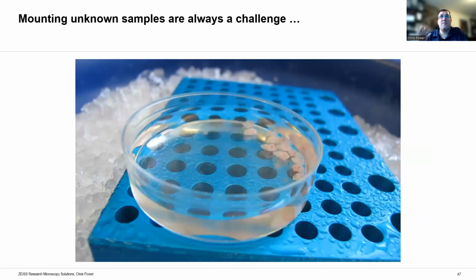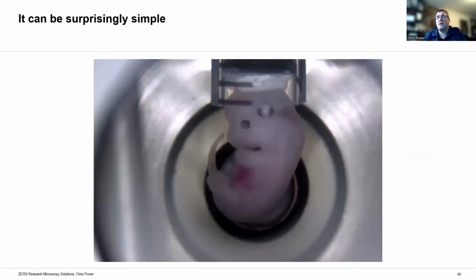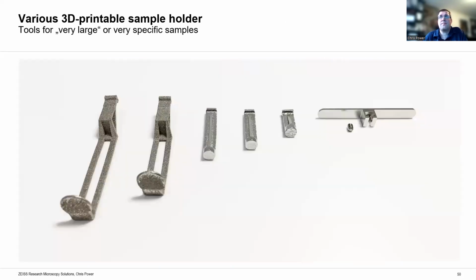To give you an example of where we sometimes think a little bit different, this was a neuronal sample. Hang on a minute, I think we come back to that one, but yeah, this was an example with, I forget the model embryo here, but this was looking at cancer cells, I believe. So again, on an uncleared sample, you won't get all the way through, but you can look from different angles and see a few hundred microns in.